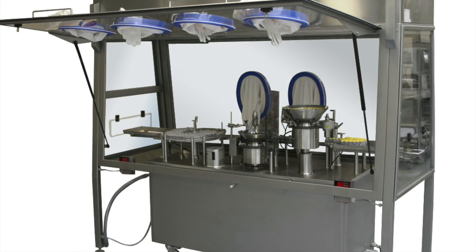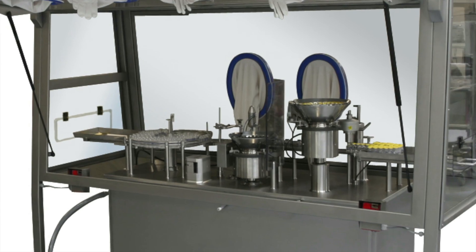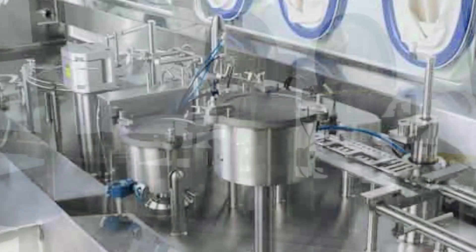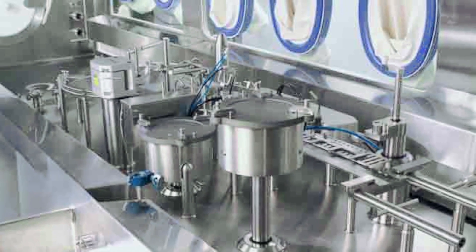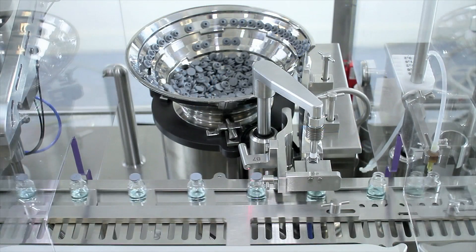The FPC-50 is designed for use under laminar airflow and can be supplied with an optional restricted access barrier system or as a customized solution for integration into an isolator.